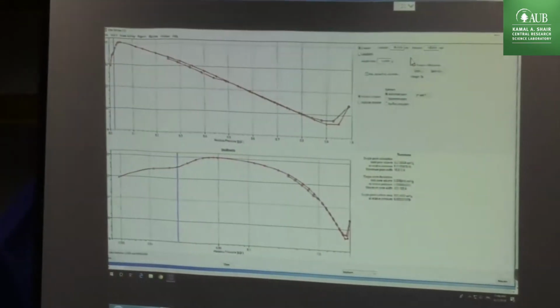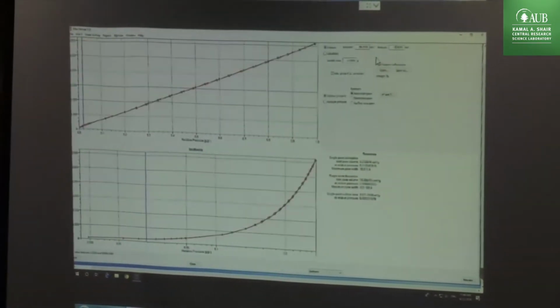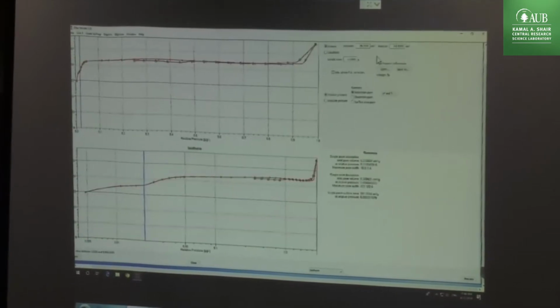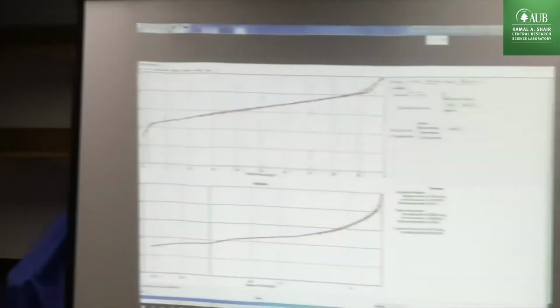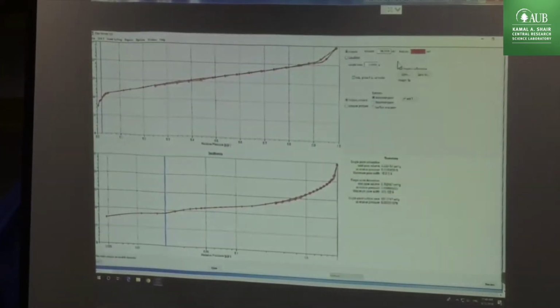Then you can go, for example, to 65. Okay, you see it's coming up. Then you see it's a free space. Then go to 64. Okay, this is one. Now I come to my experience. This is a zeolite type 1 adsorption isotherm, which means I have to have a flat isotherm. I can just leave it, for example, at 63.8 or 60.9. What's the point here? 0.9.